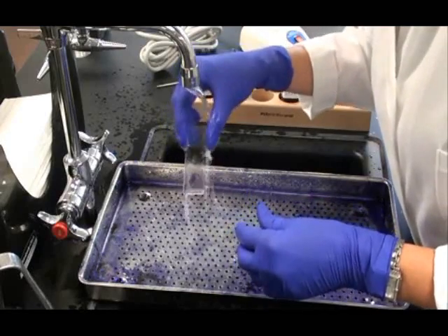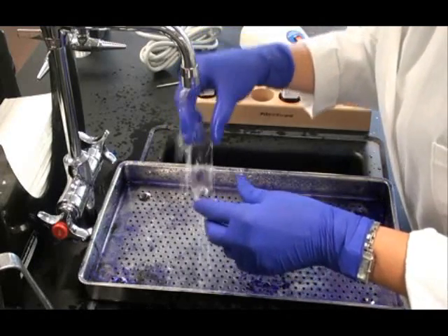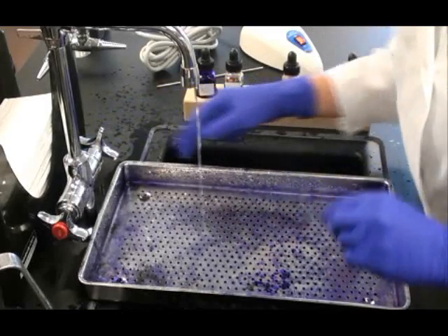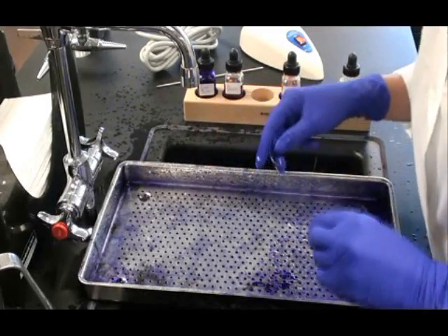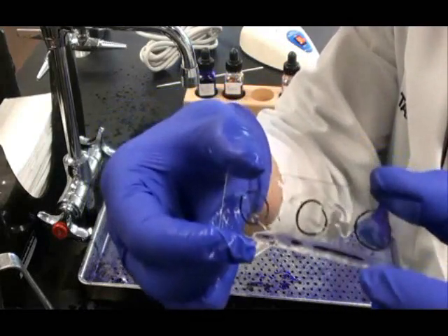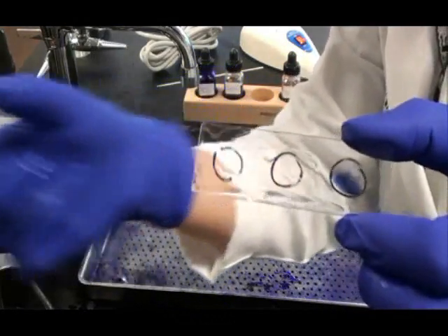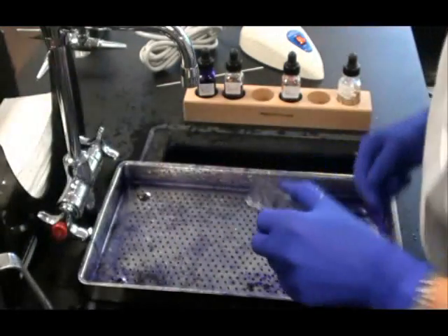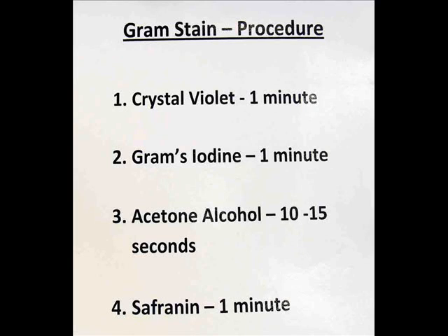Then I rinse. Let's take a look at the slide now. I'm sorry but it is reversed. I'm holding it upside down. And that puts the Gram negative control on the left. And you can see that the color was removed from that Gram negative control. It also looks like the color was removed from the unknown.